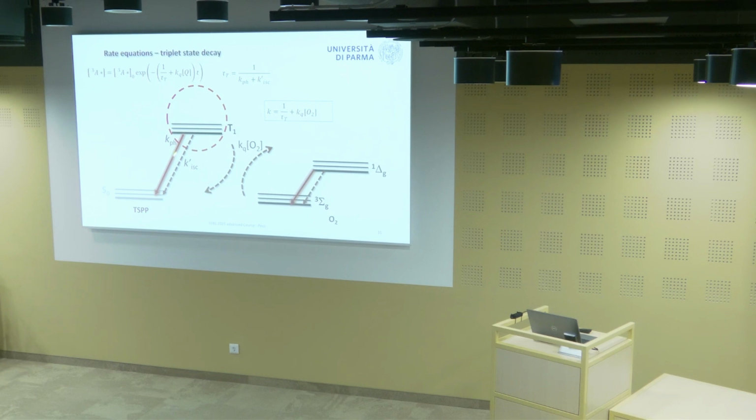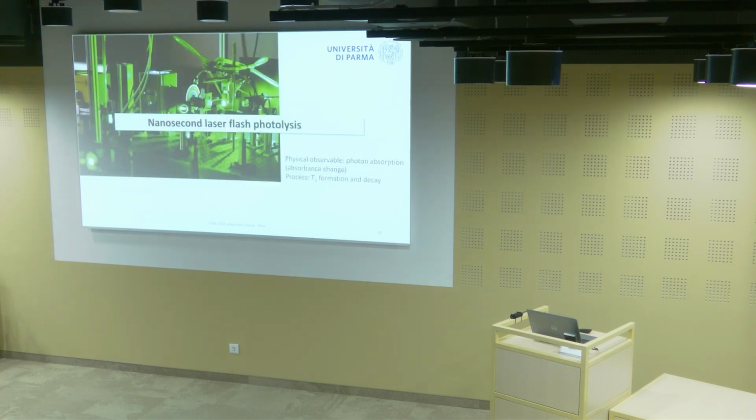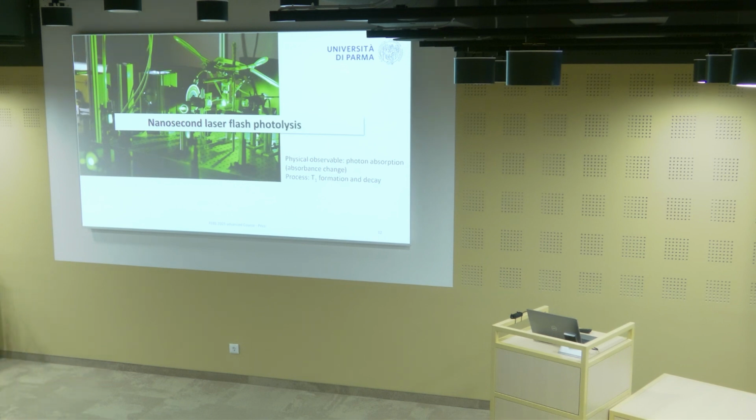It tells you that this overall rate will be oxygen dependent, very oxygen dependent. We'll see an example shortly. We will see the example using nanosecond flash photolysis. That's the technique I like the best.